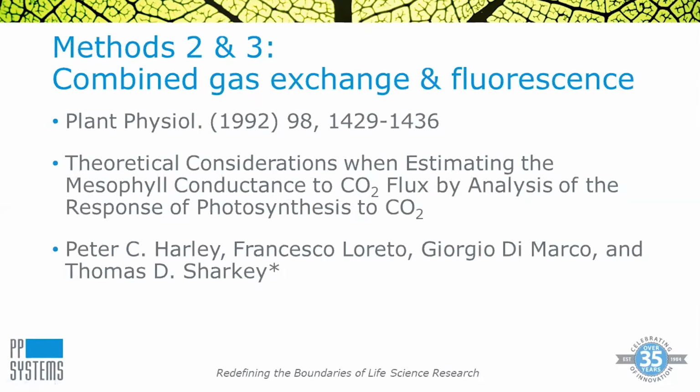Methods 2 and 3, I'll put together here because both of them use a combination of gas exchange and fluorescence measurements. The basis for this is fairly old, a 1992 reference in Plant Physiology, by Harley et al.